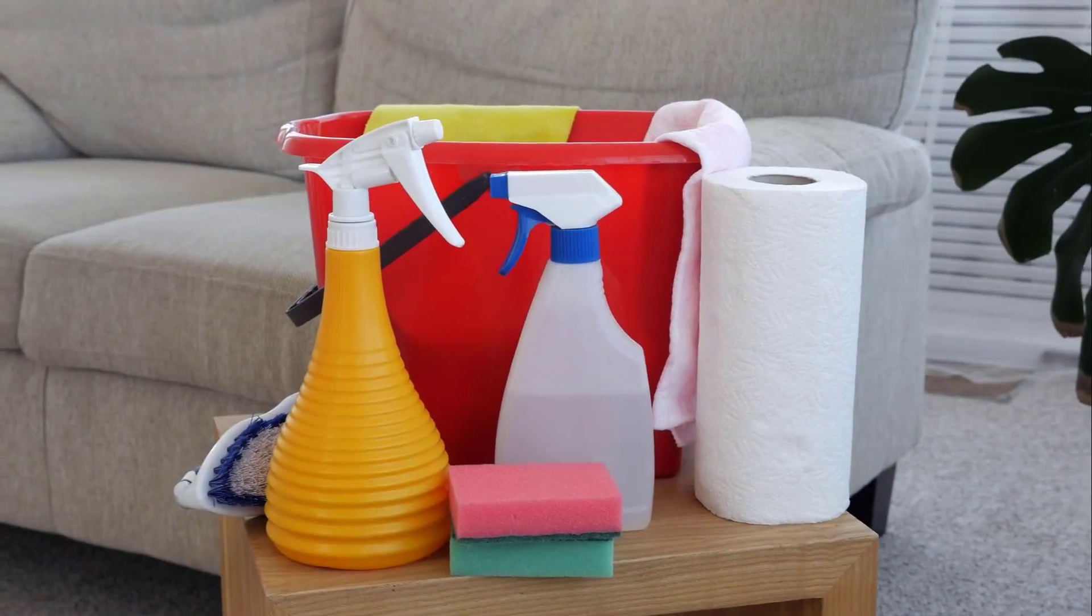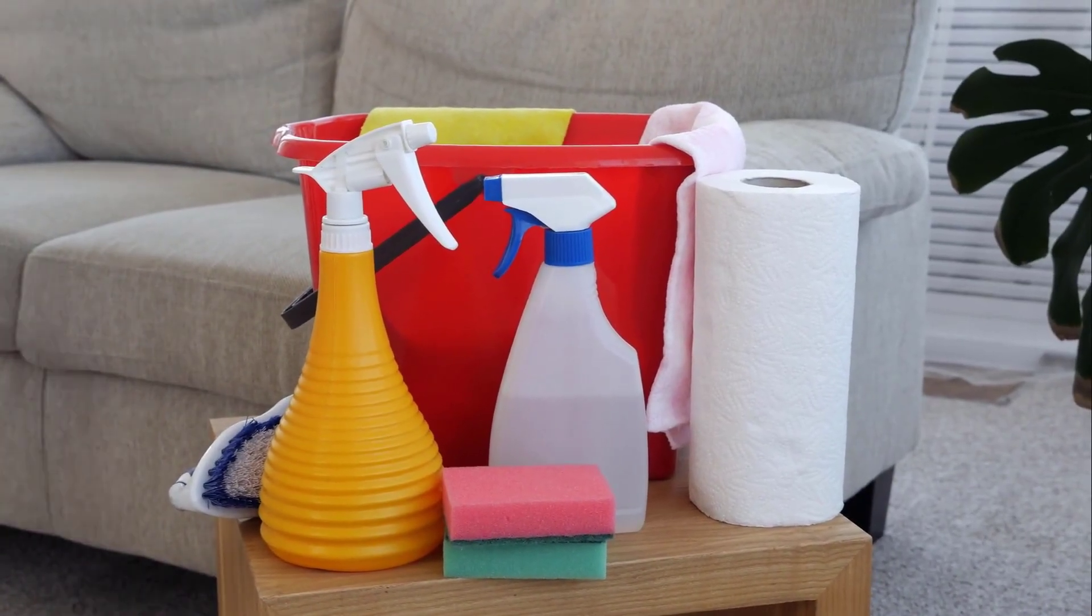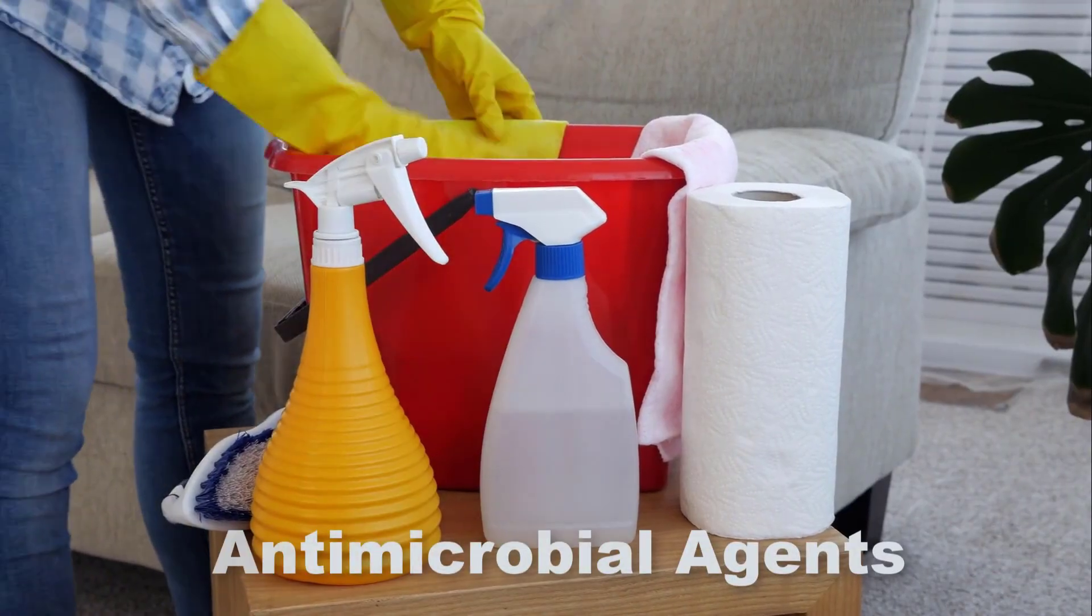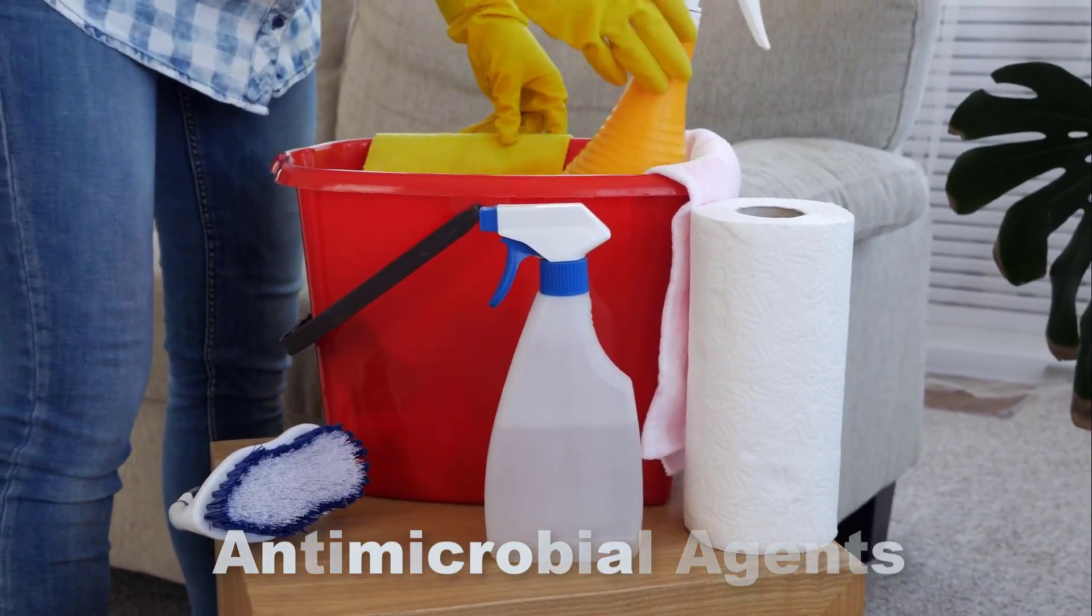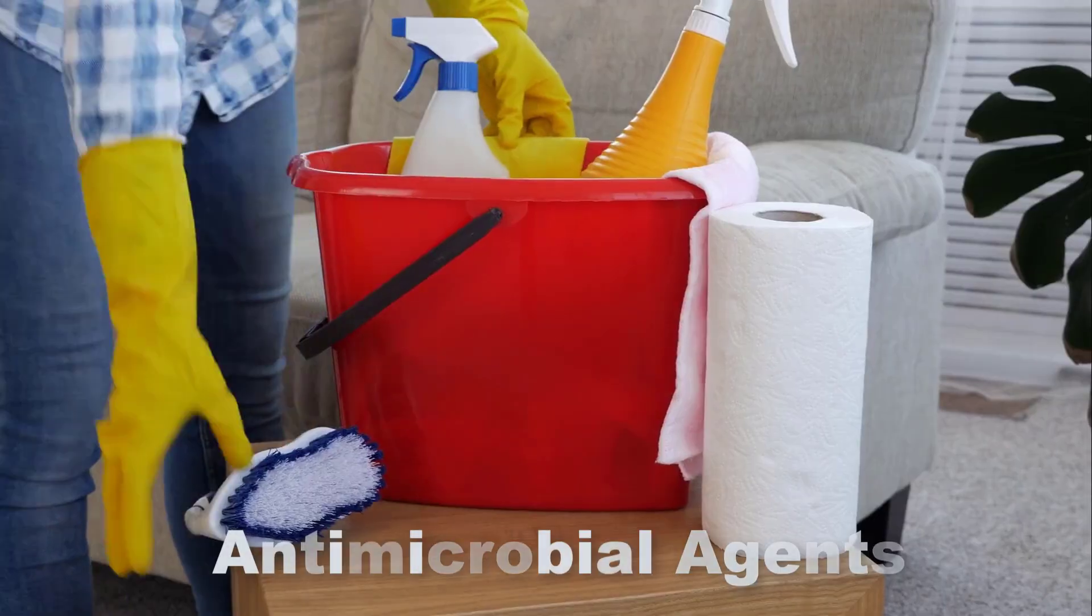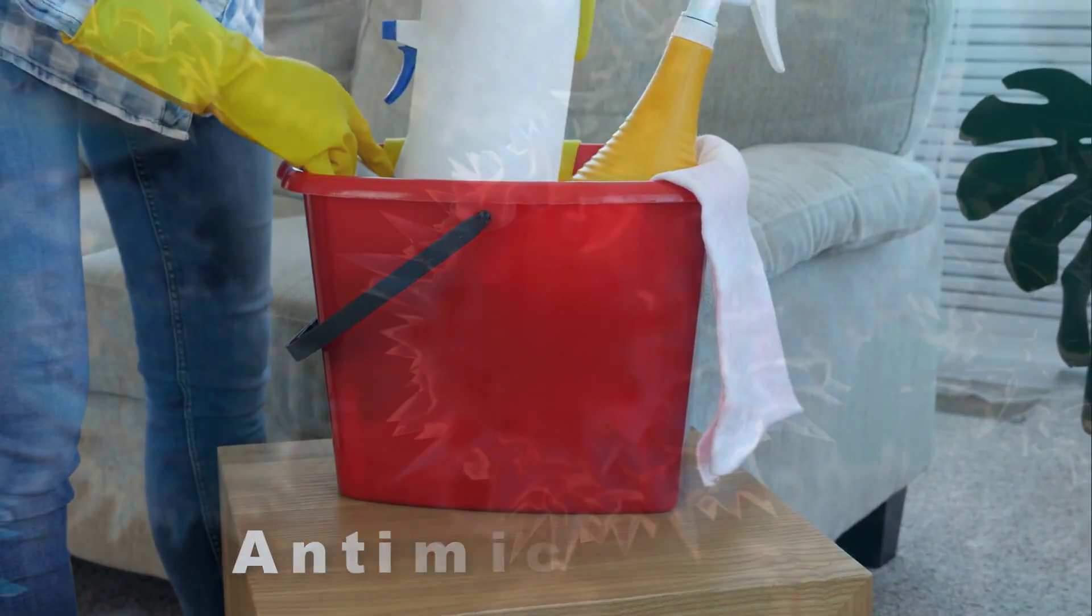Household bleach, household disinfectant, and antibacterial soaps are all chemical agents designed to kill bacteria. These substances create adverse environmental conditions for bacterial growth.